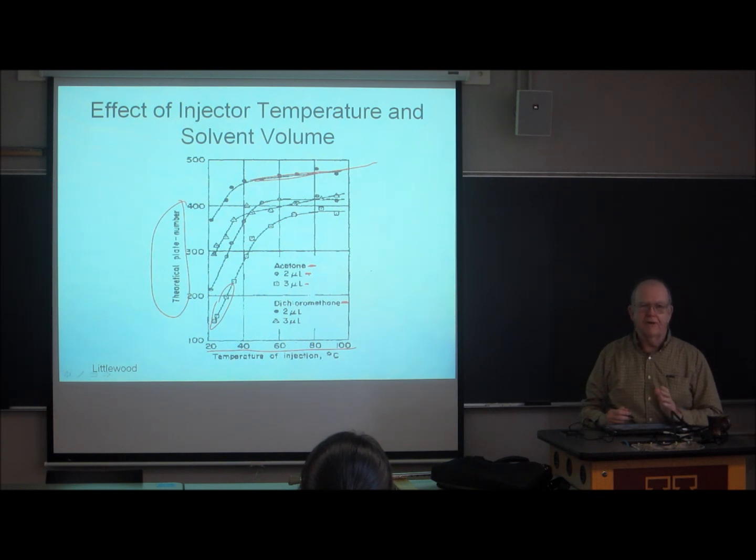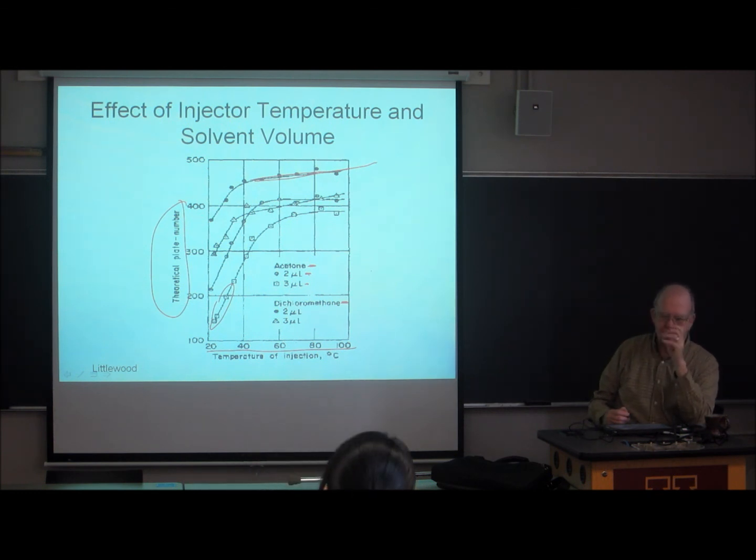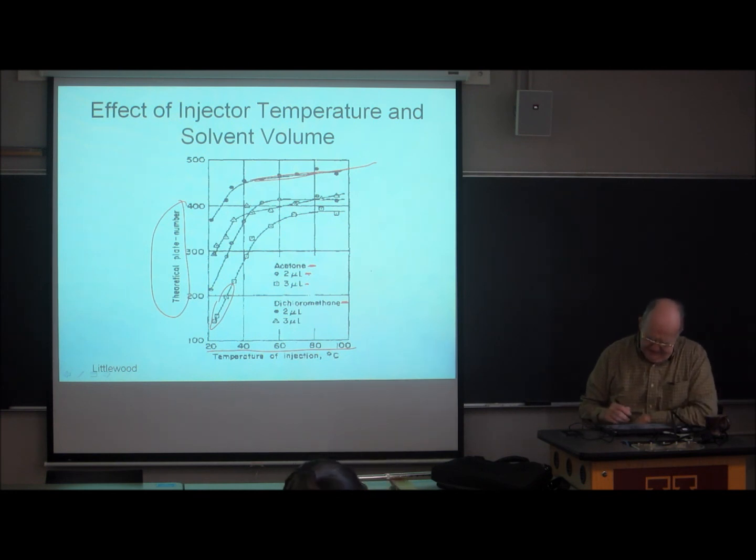It really is only good for analyzing compounds that are thermally really, really stable, or compounds that can be chemically derivatized and made sufficiently volatile that you can chromatograph them without nuking them. So the temperature is a big deal.